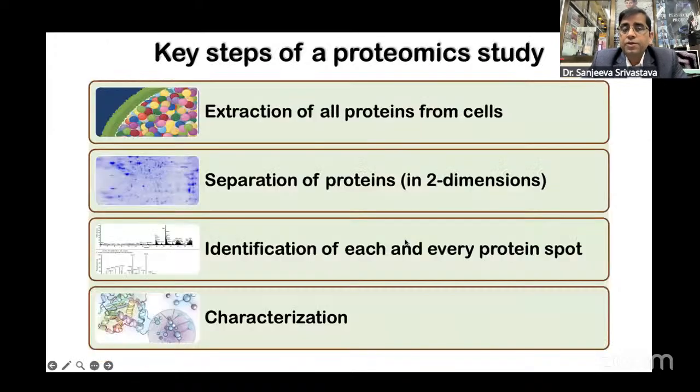And therefore, we need a variety of ways of looking at how to analyze this particular complex sample. So for a proteomic study, one can look at different workflows. Everything starts from the protein extraction from the cell. And there are different protocols one needs to try out, different lysis methods you need to try out, to ensure that everything else, for example the carbohydrates, lipids, nucleic acids, and salts, all has to be removed from the sample.